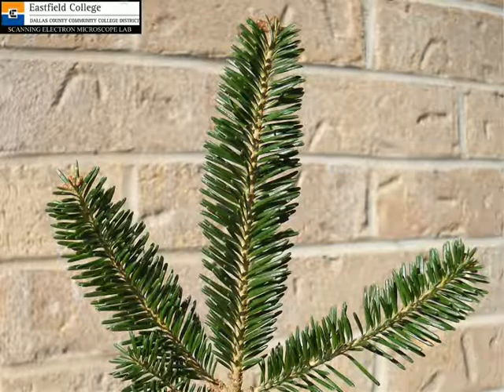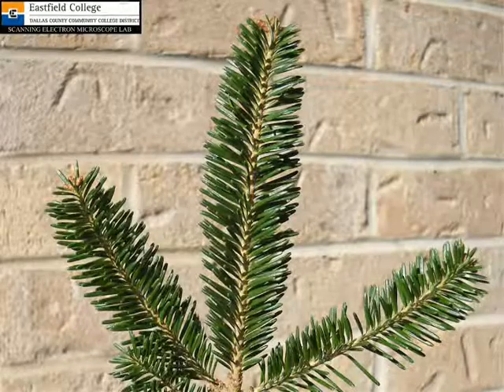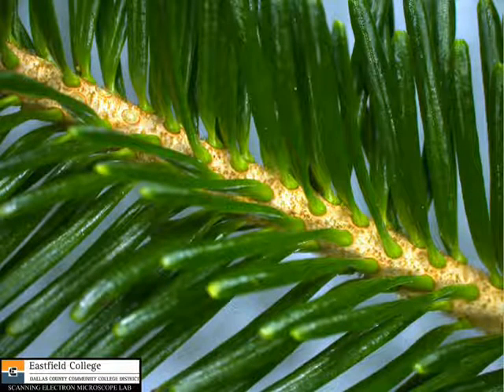This is a branch from my Christmas tree at home. This is actually a Fraser fir, I'm told. This is just a good old point and shoot picture. Here we're using the dissecting scope, and I really like this picture of this. The greens are just gorgeous.